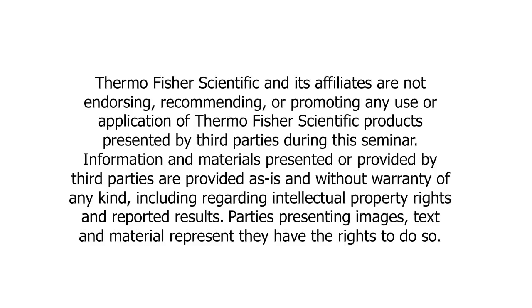Okay, let's get started. Our first question is, Dr. Cheng, what are your thoughts on ExoQuick versus UC? I think the ExoQuick product, when it first came out, we were really unsure on the level of contamination that was produced by the ExoQuick protocol. Since then, I think they've greatly improved.